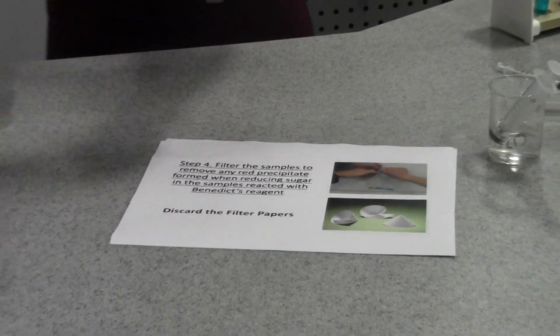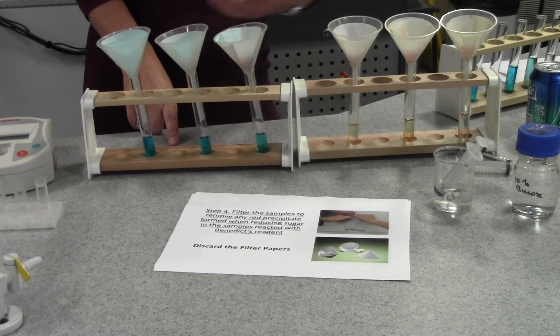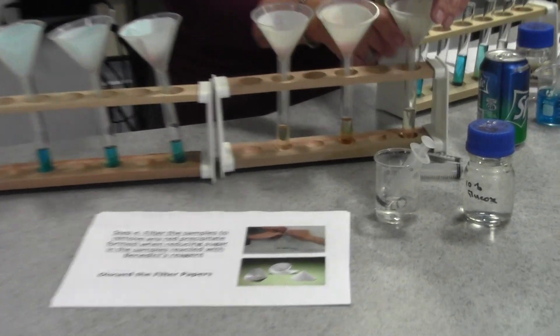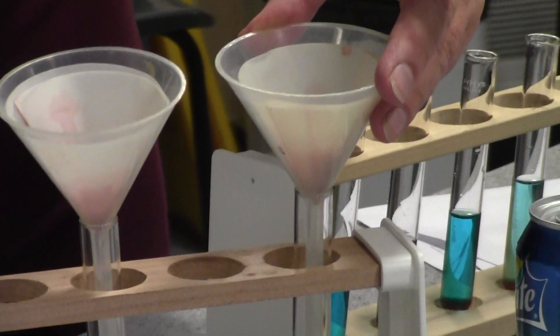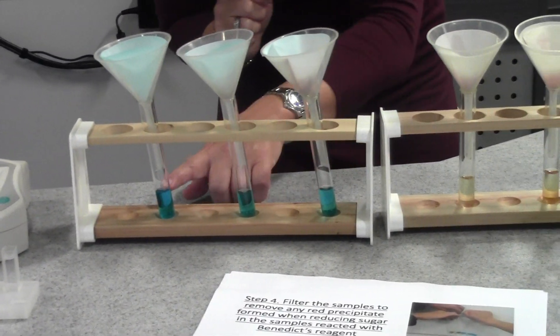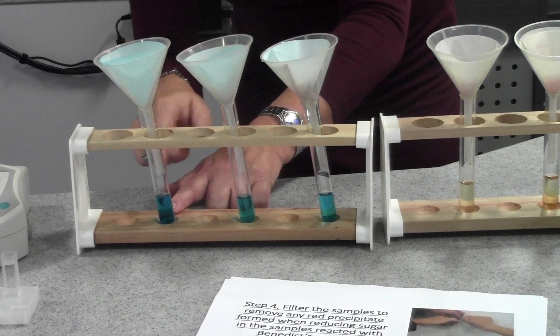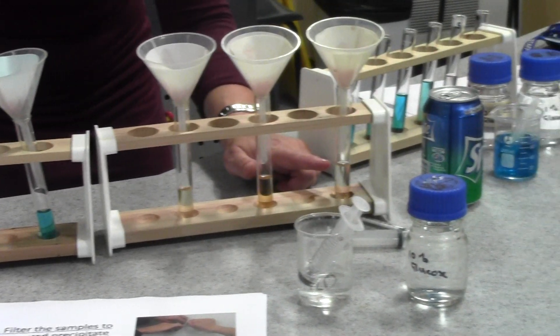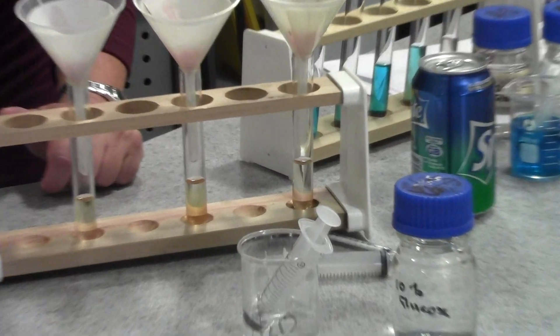I've already done that earlier, and this is our range of solutions—the results of the Benedict's test once we've filtered them. You can actually clearly see here that the solution that had the highest concentration of glucose has a large amount of red precipitate that's collected in the filter paper there. If we look at the colors of the solutions, you can see there's a range from blue here that looks like the original Benedict's—because the Benedict's has not been used up because there was no glucose to react with—right the way through to the other end where all of the Benedict's reagent has reacted with the glucose to produce precipitate, and so we've got no blueness left.